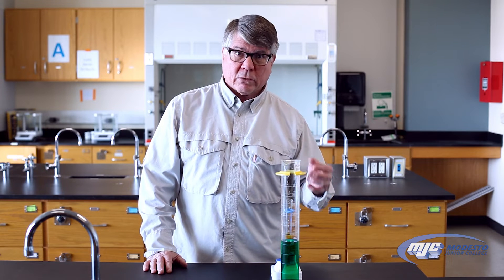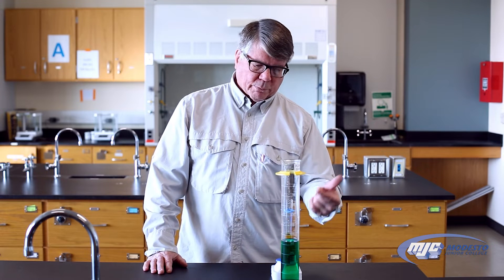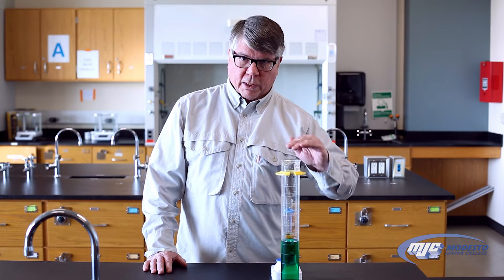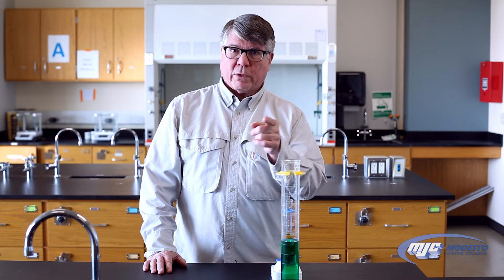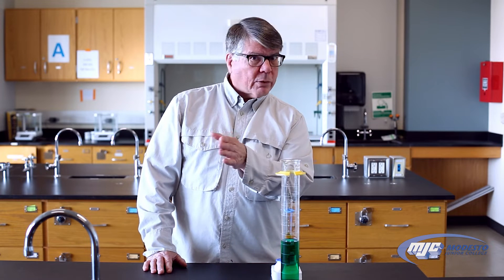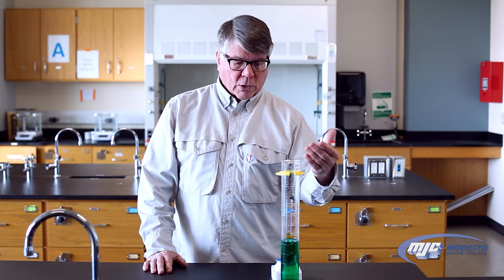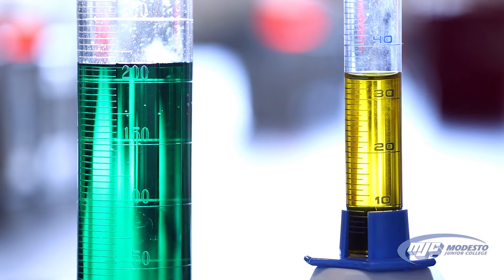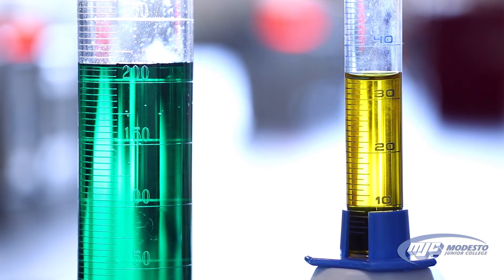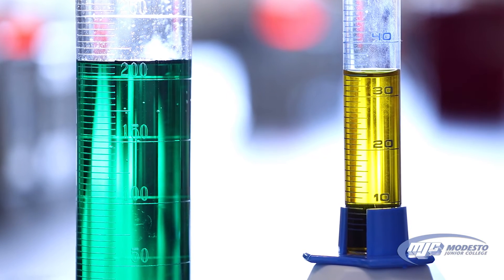It is important that you record every measurement that you make with that graduated cylinder to the correct place. For example, on this graduated cylinder, if the measurement was 200 milliliters right on the 200, then you would need to write 200. with a decimal point showing that all three of those digits are significant figures, but nothing to the right of the decimal, and the units are milliliters (mL). Whereas with this graduated cylinder, if this was right on the 10, you would record 10.0 — a zero in the tenth place — and the units again would be milliliters (mL).